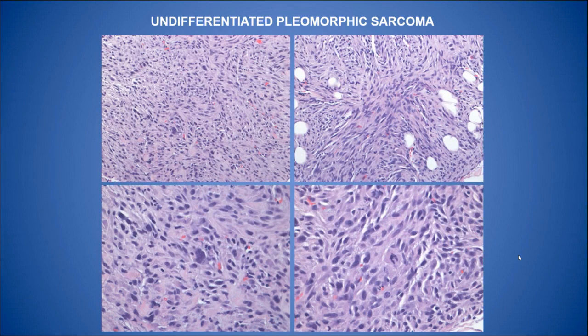It is important to rule out the presence of woven bone formation within the tumor, in which case the tumor needs to be reclassified as a high-grade osteosarcoma. You may find bone formation focally in UPS, but it's usually of metaplastic characteristics. So it may have a somewhat trabecular appearance and not really be the lace-like pattern of woven bone formation that you characteristically see in an osteosarcoma.